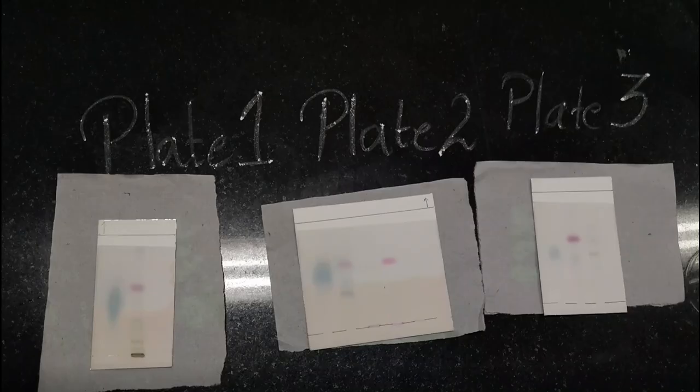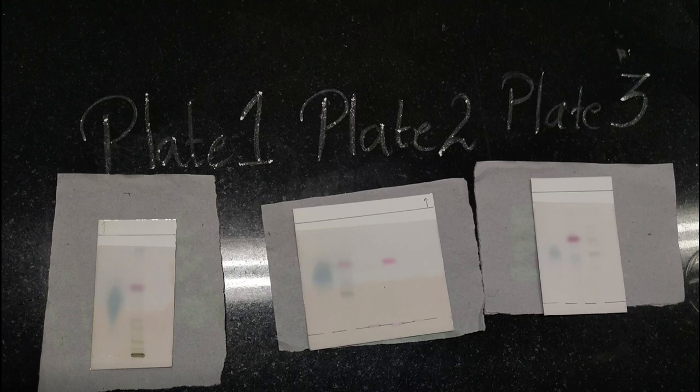After visualization, different color bands are observed, indicating presence of different terpenoids, which can be eucalyptol, thymol, eugenol, etc.